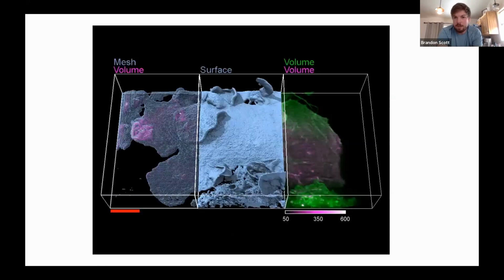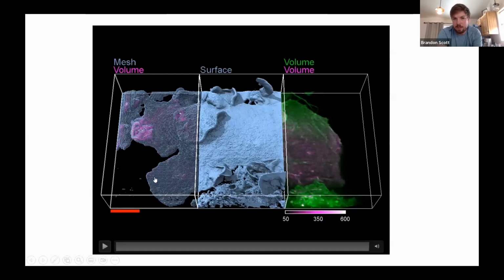And so here would be an example now of a movie showing the different capabilities that we can do. So this is split up into thirds, so we can look at colocalization between two fluorescent proteins here. These are two volumetric intensity projections, just an isosurface rendering of our macrophage, and then this combination of the mesh and the volumetric intensity underneath of that.